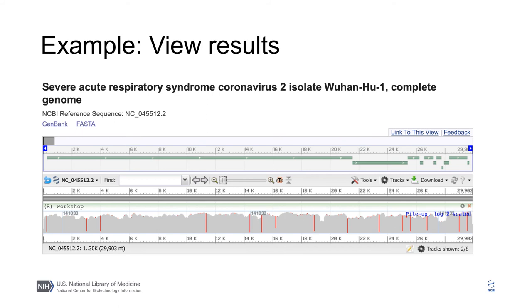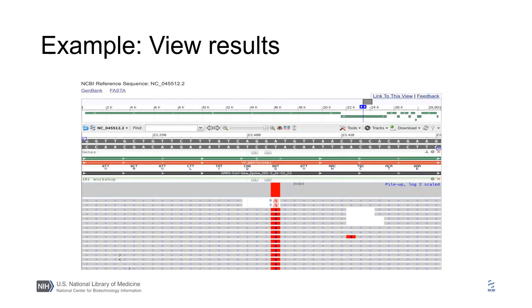The red bars show locations of differences between the reads and the reference. The fact that these are straight, long lines indicates that these are changes in the sequence genome. Zooming into one of these differences, we can see that adenine in the reference is replaced with guanine, and the codon coding for aspartic acid in the reference codes for glycine in the sequenced genome.